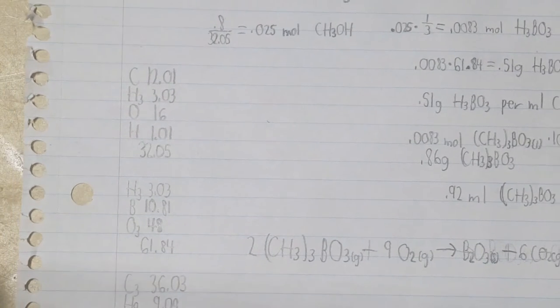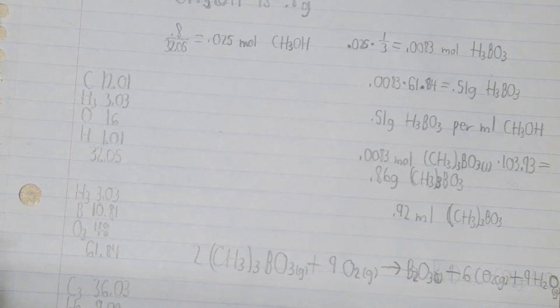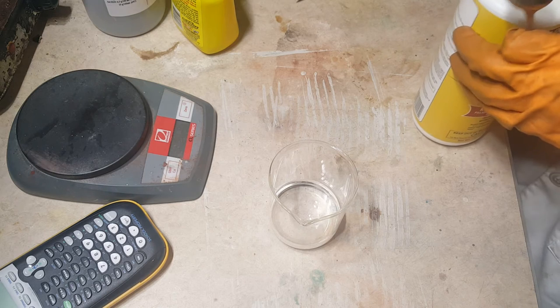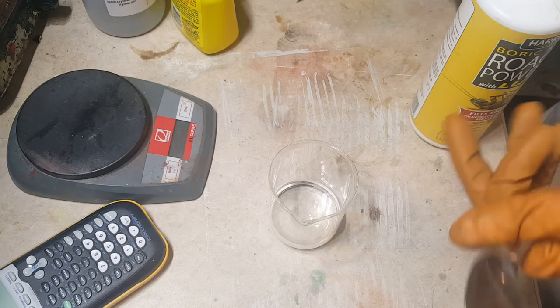So theoretically, if both my chemicals were completely pure, then I would need 0.51 grams of boric acid per milliliter of methanol. But since these are hardware store-bought chemicals and the reaction occurs in equilibrium, I won't actually need that much boric acid for a complete reaction. So all we need to do here is get the methanol — I've got about 50 milliliters — and I'm going to add boric acid until no more will dissolve and react, and we start seeing solid on the bottom.